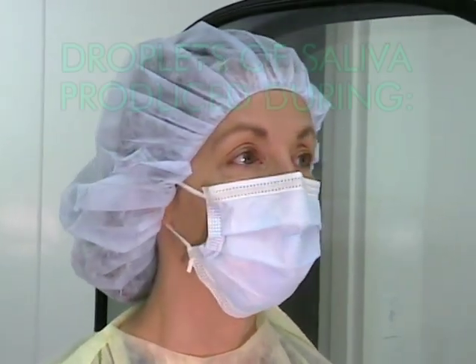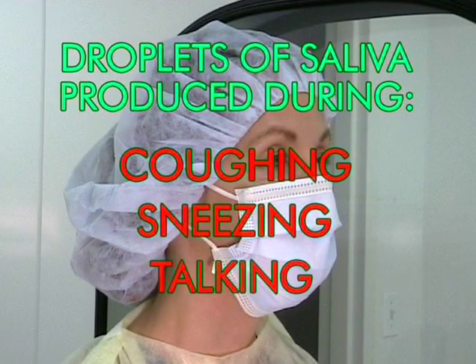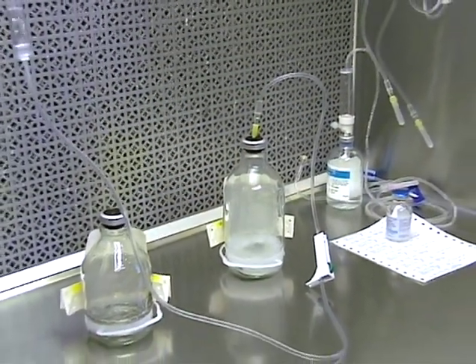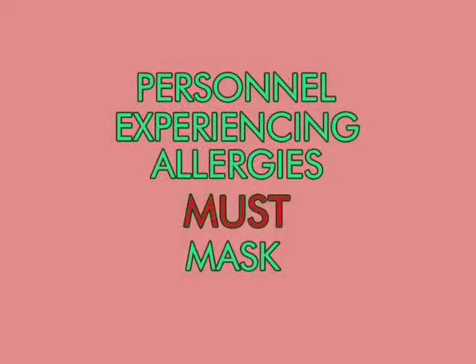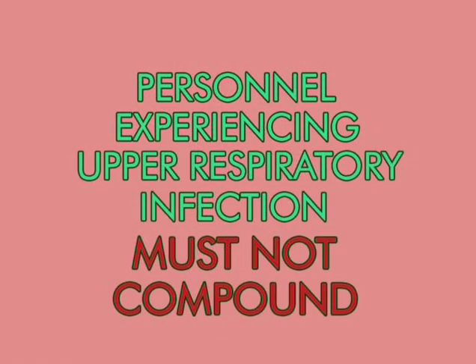Breath masks offer product protection by providing a physical barrier for absorption of sputum and help prevent it from entering the work zone when the operator inadvertently speaks or coughs. Droplets of saliva produced during speech, coughing, or sneezing can reach velocities of 5 to 25 feet per second, which can easily deposit them directly onto critical sites. For obvious reasons, the use of masks is especially important for personnel experiencing allergies. Personnel with upper respiratory infections should not compound IV products.